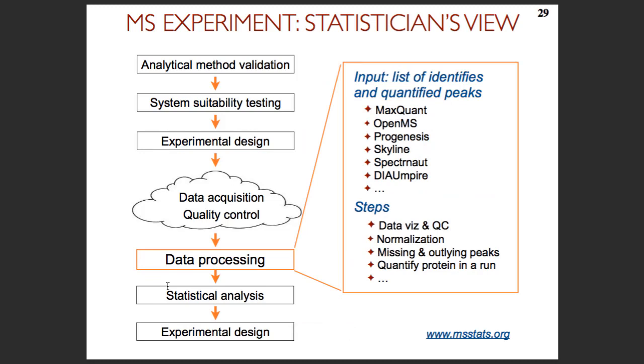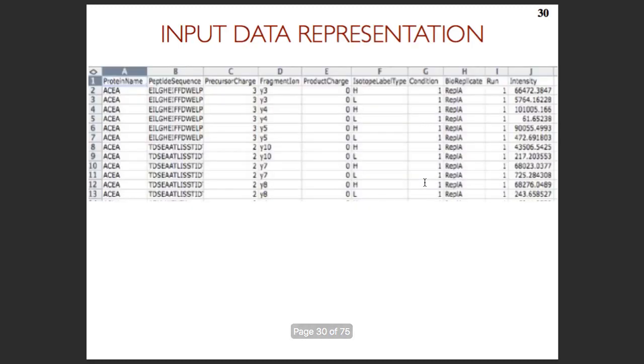And so now the next step, which is very important, is data processing. As I mentioned earlier, we don't do this ourselves because there are people out there who do it much better than we do. So we don't reinvent the wheel. We work with them. We have all of these different tools, and you will find on the website documentation on how to work with different tools. And after that, once we read it, I think I have an example here. Yes, so we have something which we call a 10-column format, where essentially we read in data which can be stored in an Excel spreadsheet.